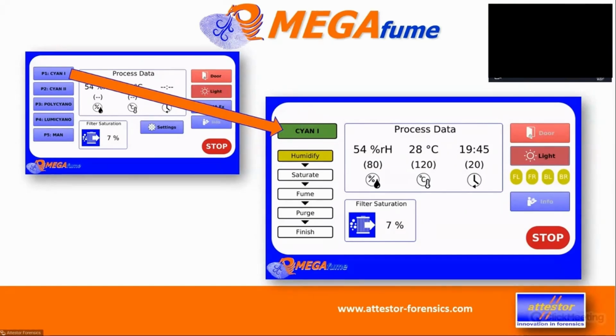There's one field that is new in the actual process, which is down here. So apart from just switching the light on and off, our light is actually in the four corners. We have LED stripes down the whole length of each of the corners, and we can activate or deactivate them individually.